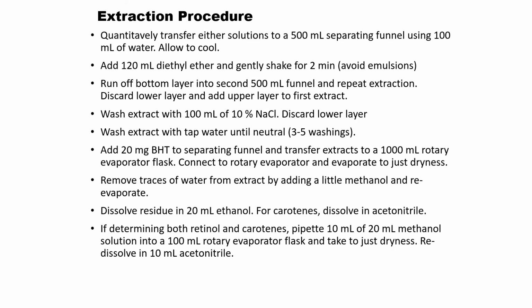As for the extraction procedure, quantitatively transfer the solution to a 500 ml separating funnel using 100 ml of water, and allow to cool. The procedure is basically adding the ethyl ether and shaking for 2 minutes to avoid emulsion. Then run off the bottom layer into a 500 ml funnel and repeat the extraction, which is LLE. It's a very conventional LLE method. So discard the lower layer and add the upper layer to the first extract.